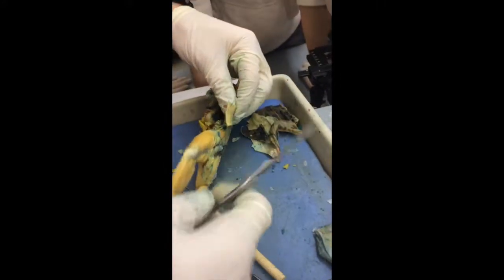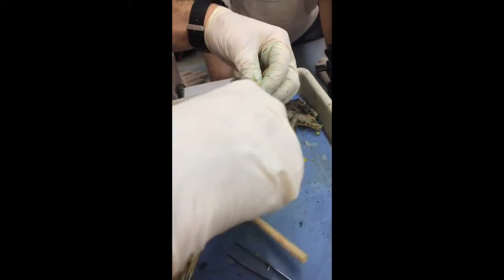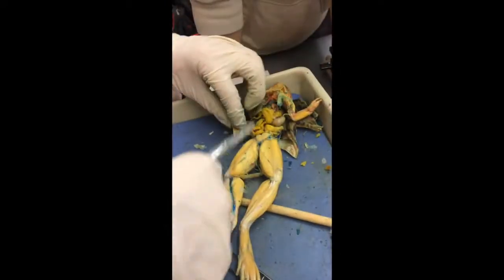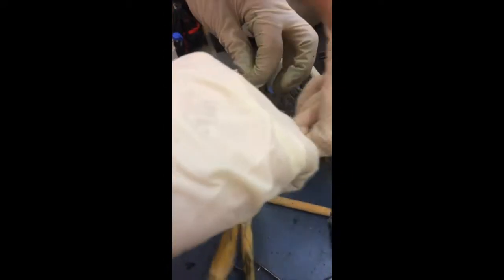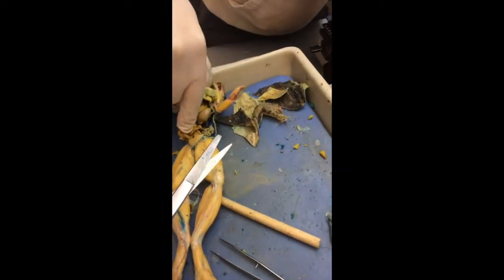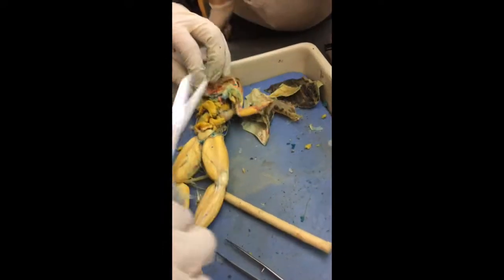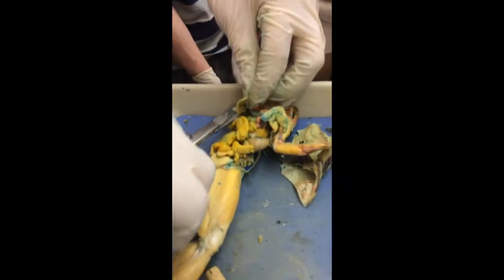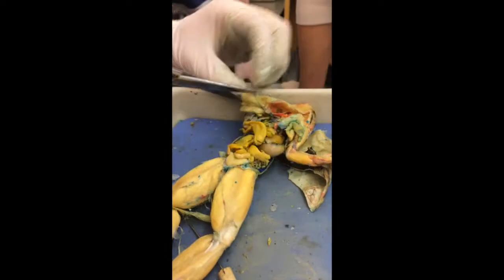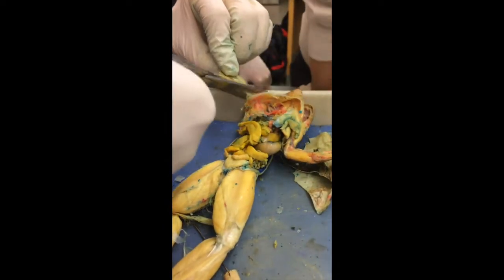Looks like noodles and, like, intestine? It's so tubular. It's like traditional soup noodles, ramen. You mean the oviducts? That's the oviduct? Everything else is kind of squished in. It's very clear.